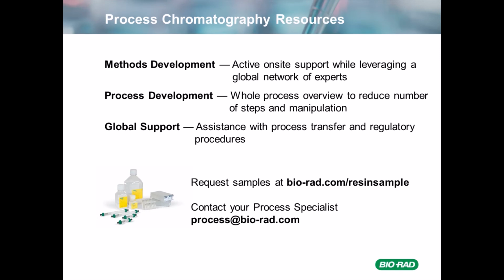Well, this is a good question because we know that usually protein purification is probably a little bit more complicated than just pH and sodium chloride concentration. You can consider using buffer additives such as arginine, glycine, or propylene glycol. Arginine, for example, helps minimize the non-specific interactions and often results in better target recovery and selectivity.